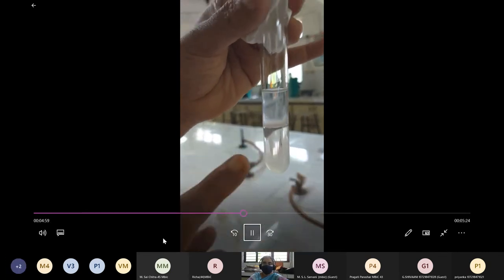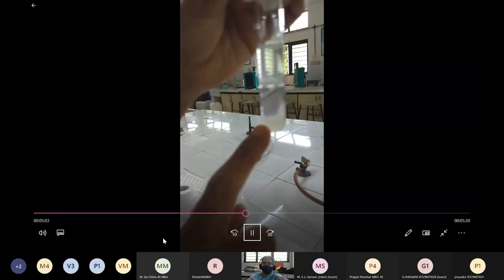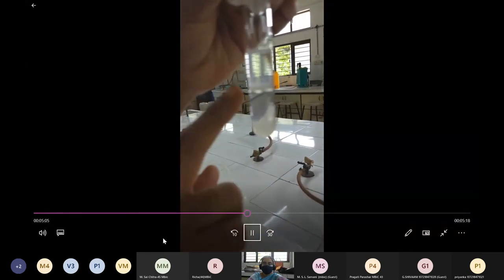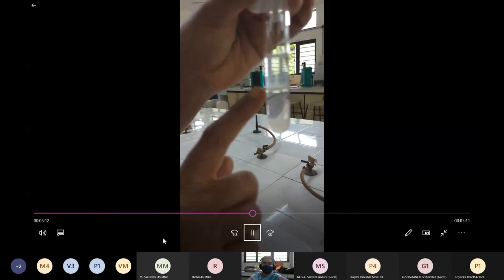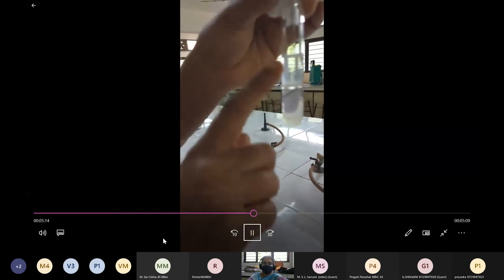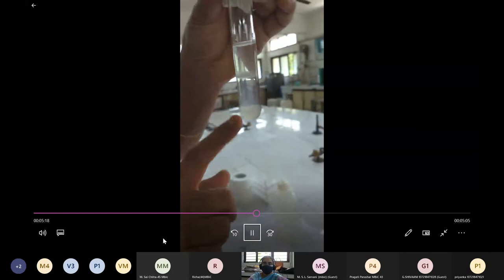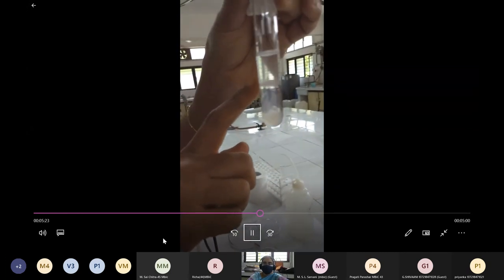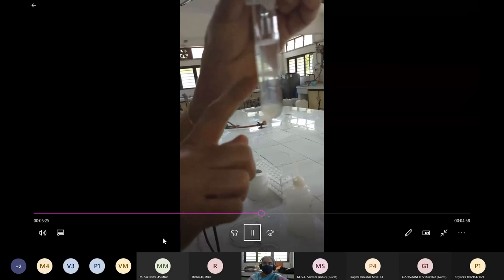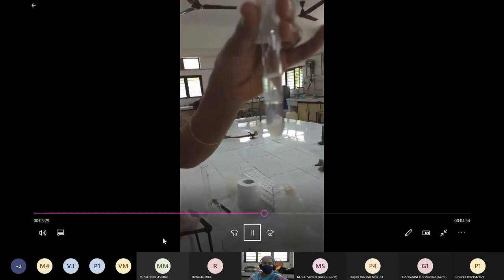The white strands are floating on the surface. The lower layer is the aqueous layer of the extract; after adding SDS and then ethanol, the DNA has been extracted, precipitated, and accumulated on the ethanol layer — the organic solvent layer. Because once DNA binds with the salt, it becomes insoluble in the organic solvent, allowing it to precipitate as visible white color strands on the ethanol layer.